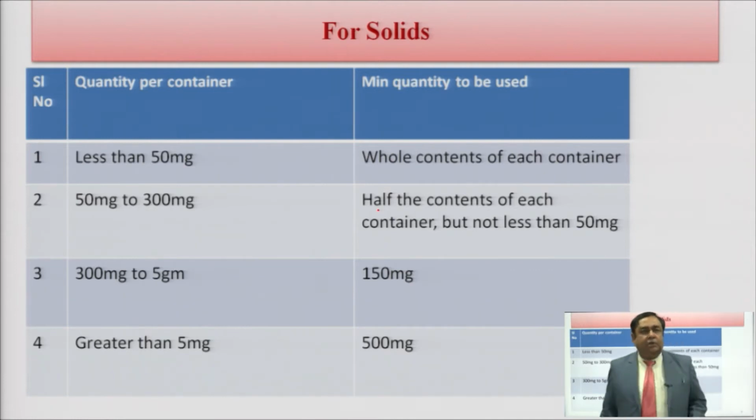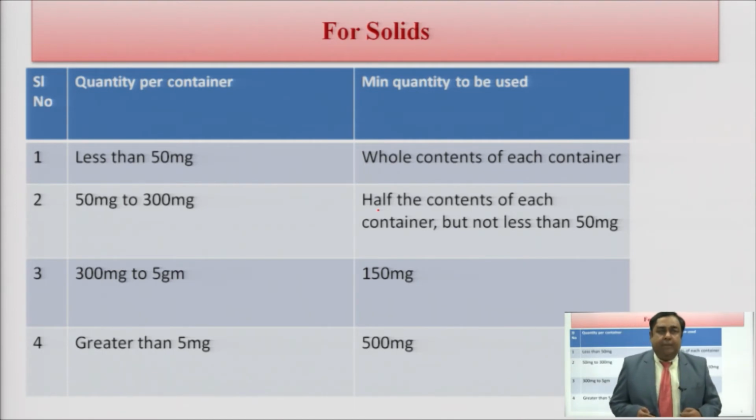Now, as far as solids are concerned, if you are testing a solid where the package is less than 50 milligram, you have to take the whole content of each container.